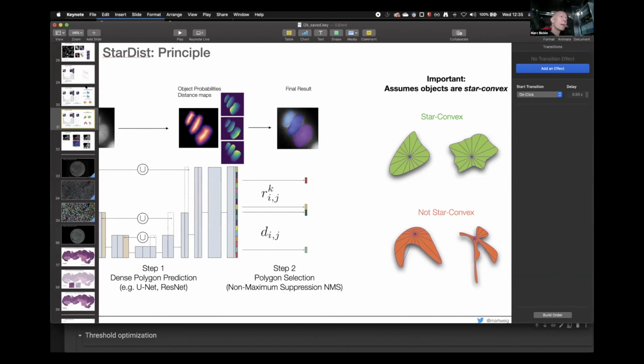Could you use a superpixel type of thing, where based on certain properties of the network, if there is certain connectivity, you would count it? You could make every individual instance prediction into a supervoxel and just have edges between overlapping things, and then define a criterion, the cost of that edge, and do this fusing aggregation based on that superpixel graph. That is true, yeah. But it's something that has to be tuned per problem, but it's a good idea.